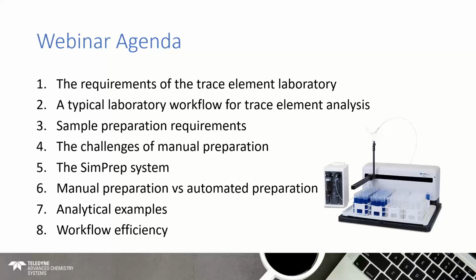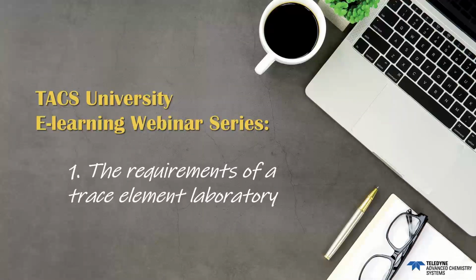Then sample preparation requirements, and the challenges of manual preparation for a trace element laboratory. Then we'll look into automating that, and then a comparison between manual preparation versus automated preparation with some examples, and then we'll look at workflow efficiency at the end.